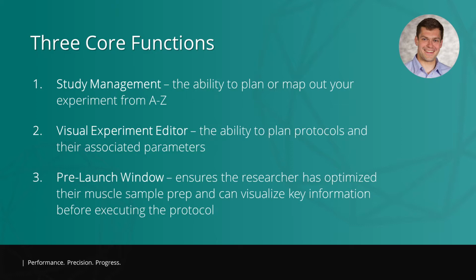The first is this concept of study management. The idea behind study management is that it gives you the ability to map out your entire experiment from start to finish. So what parameters you want to track, how many samples or animals you plan to have in your study, exactly what functions you want to have in any experimental protocol.